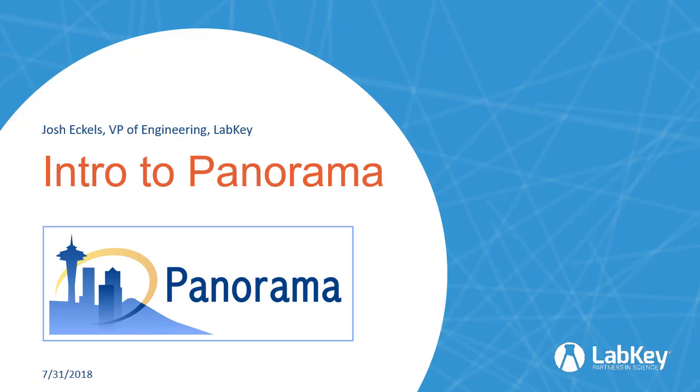All right, thanks, Mike. So maybe I can get a quick show of hands. Who, before getting an email with a link to an account in the past couple of days, had heard of Panorama before coming here? All right, cool. And had any of you actually used it a little bit?